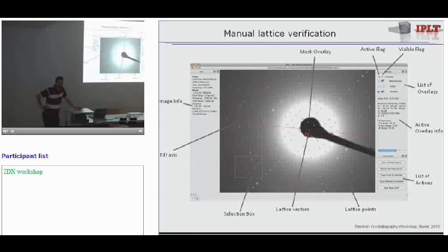And that picture is obviously a lovely picture. Any program will be able to integrate that. But if you get flakier and flakier, then you might profit from profiling. Then you basically don't want to use anything automatic. You want to do everything manually. Yeah.